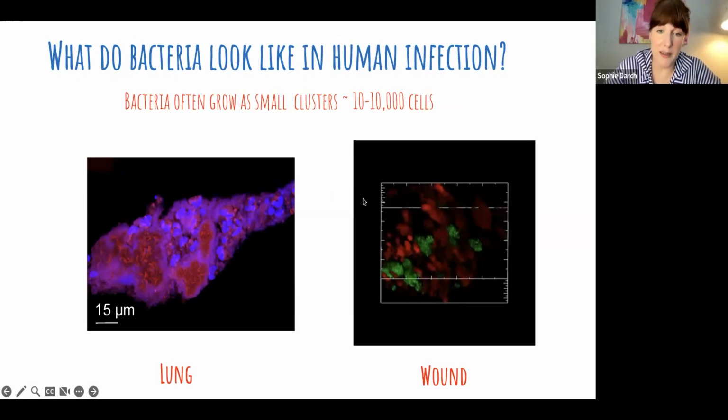So when we're actually looking at just the bacteria in the lab, we grow them in a special media that has all of the nutrients and all the food sources that they really like. And so what we're able to do is take pictures very, very quickly. I said that the bacteria can move. What we do is we take images very, very quickly, like every second or so, and then we're able to actually capture those bacteria moving.